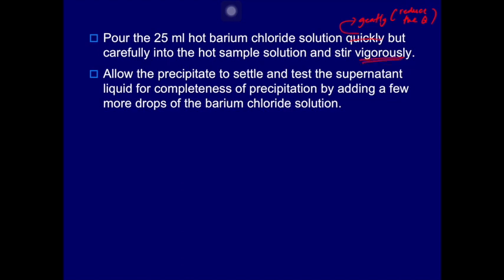This one is very important. You have to stir vigorously in order to break the electric bilayer. Breaking the electric bilayer would result in the formation of fewer colloidal particles. So we don't want colloidal particles to form.